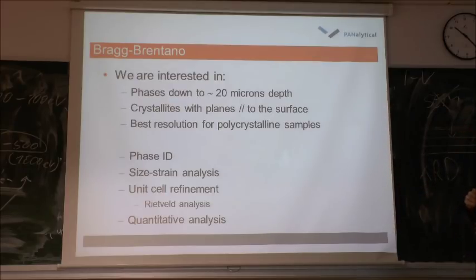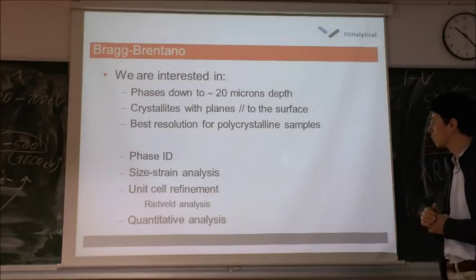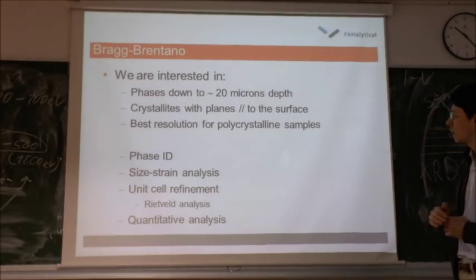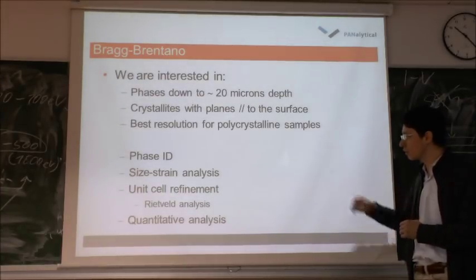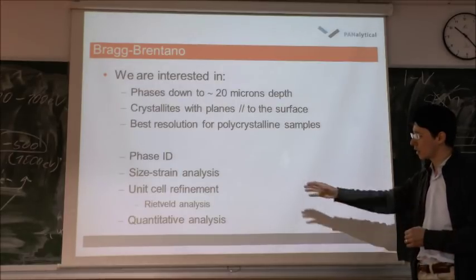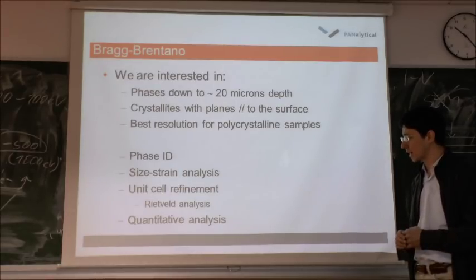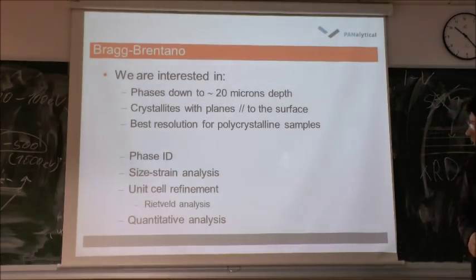We analyze crystal planes which are parallel with the surface, and this application is most suitable for polycrystalline samples. So we analyze which phases we have, what is the symmetry of each phase, and what are their size and strain. We can then refine exact unit cell parameters and do some quantitative analysis.